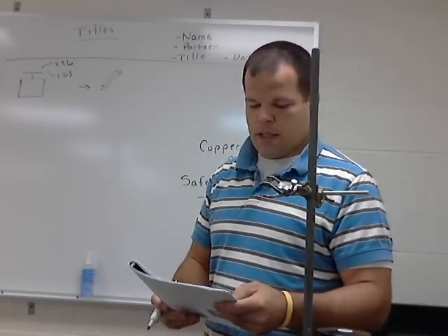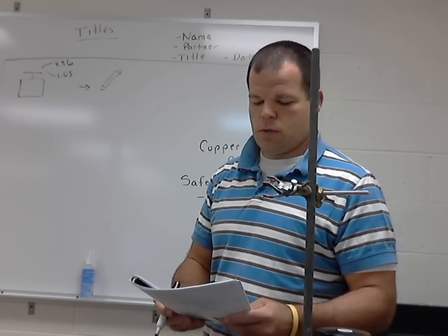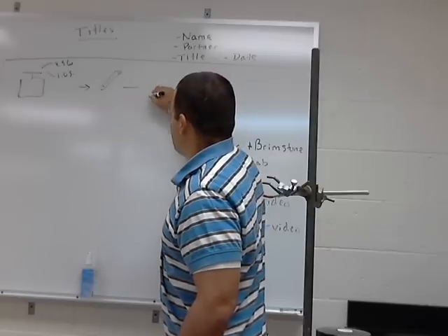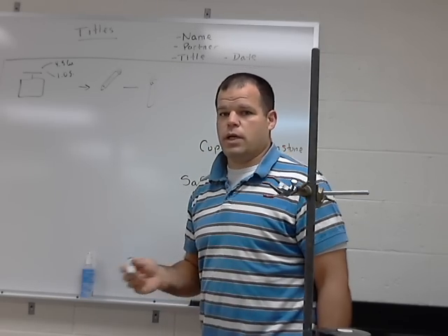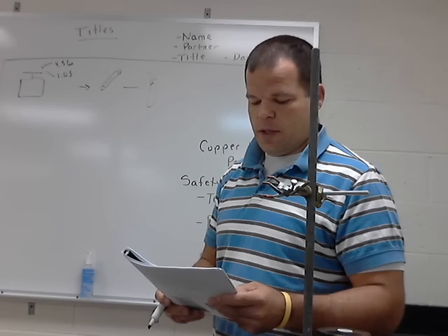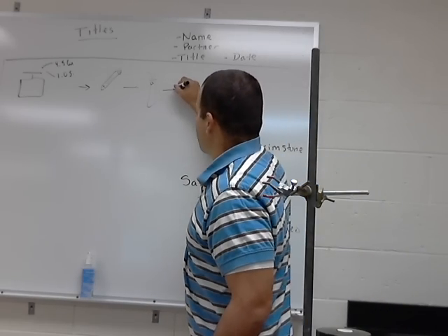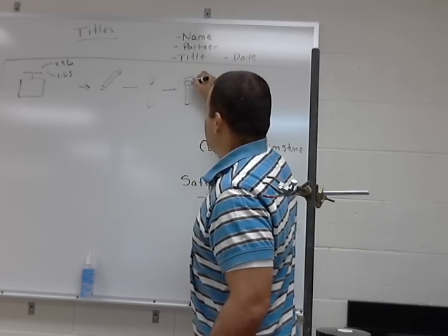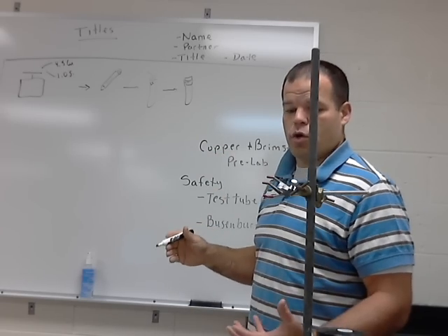Step 3 says pour sample of sulfur and copper into test tube. So now I might draw another picture with a test tube showing that I'm dumping the contents in there. Okay, so that's my next step. Step 5 says cover the open end of the test tube with aluminum foil squares and secure. So maybe the next step shows the test tube with a little cover over the top. Okay, and this is the general idea of how you draw your pictures.